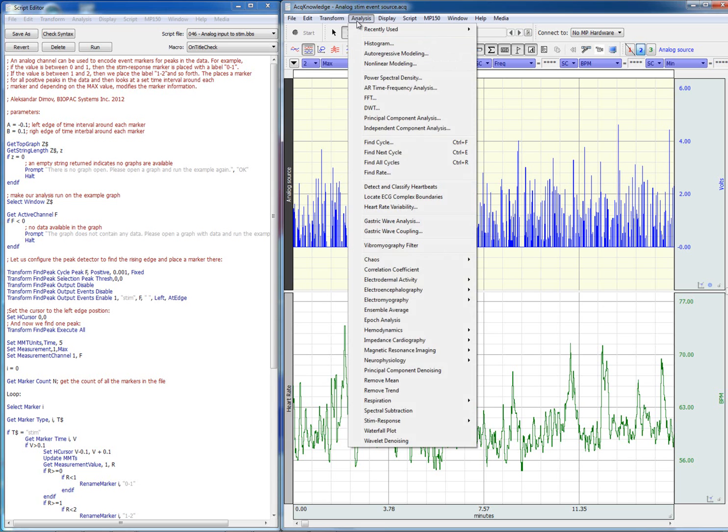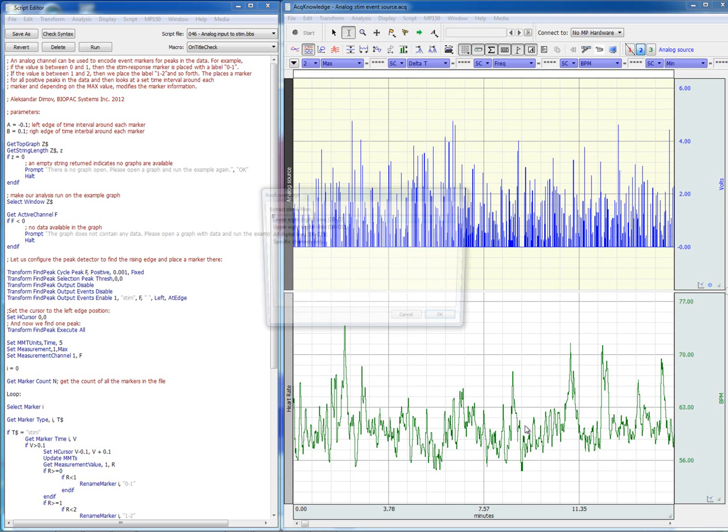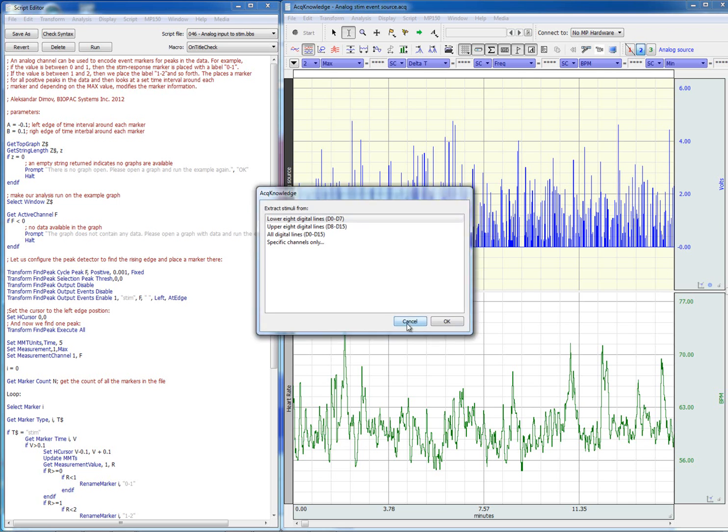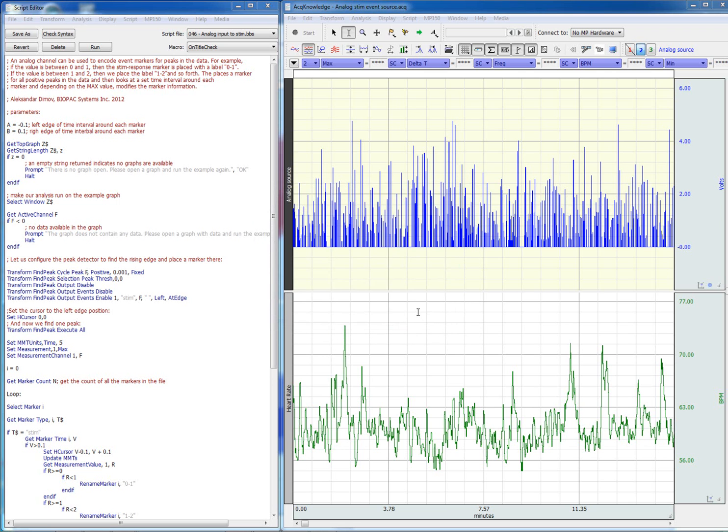If we go to analysis, stem response, and digital input to stem events, we'll be able to convert digital channels, or any channels in fact that contain 5-volt pulses, into markers. This script does something different.